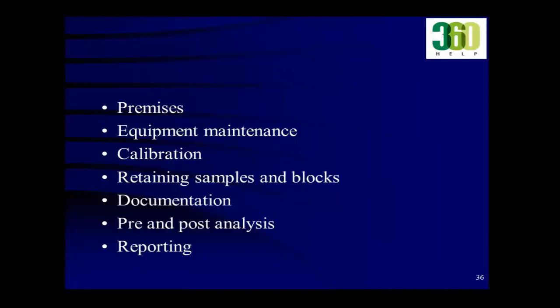There is a reporting room. Grossing has formalin. Am I assuring that formalin is checked day to day? What are the procedures to keep the concentration of the formalin in a room at a proper level where it is not harming your health? So all these things are very, very important when we talk about the premises.